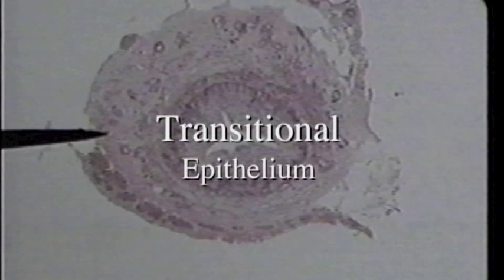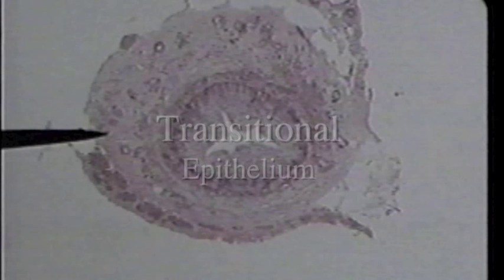This is a cross-section of the ureter taken at low power. We are interested in the ureter because it is lined by transitional epithelium. In this slide you can see a star-shaped lumen. The tissue surrounding the lumen is transitional epithelium.